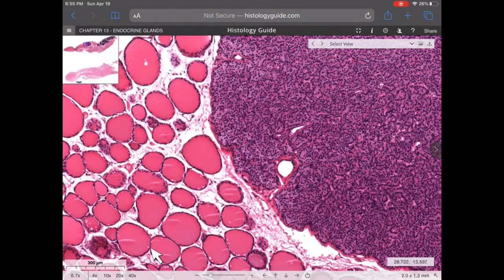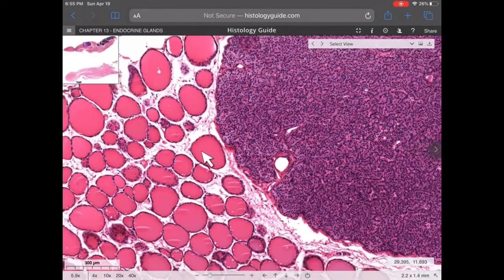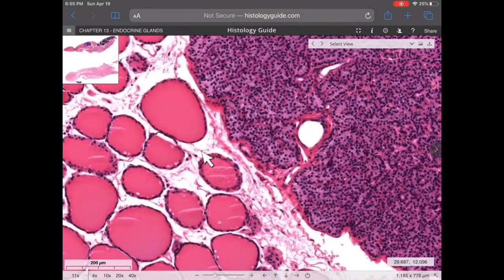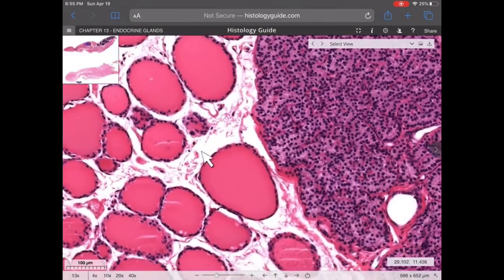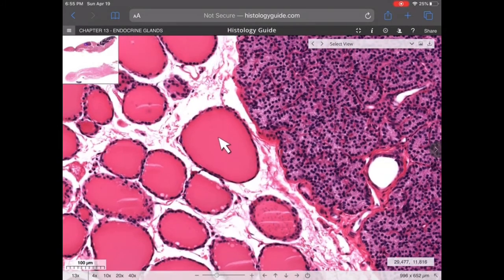And thyroid follicles are basically balls of simple cuboidal epithelium that are hollow. So imagine a simple cuboidal epithelium sphere that is a hollow ball. In the center of the hollow ball is stuff called colloid. So the definition of colloid chemically is a solid suspended in a liquid, typically a protein solid suspended in a liquid. But in this case, thyroid hormones are amino acid derived, but they're also carried on thyroglobulin. So there's a mixture of those things in here.